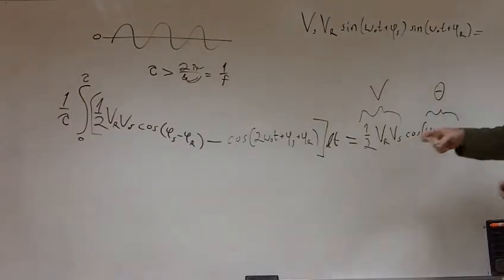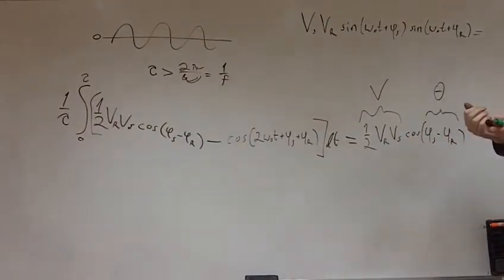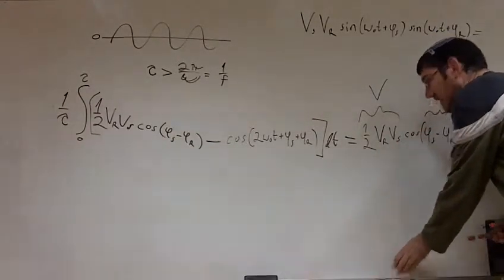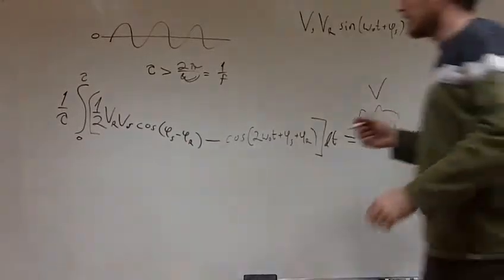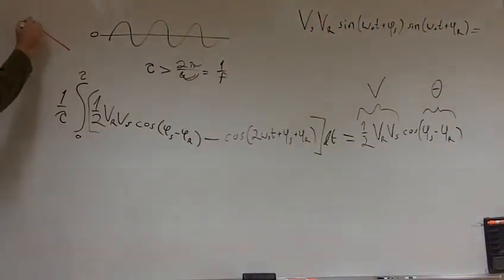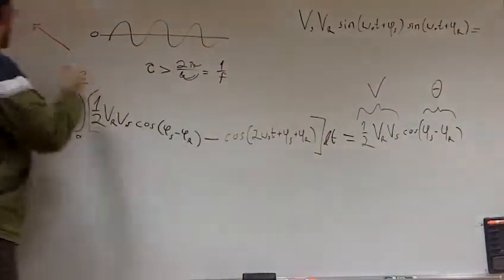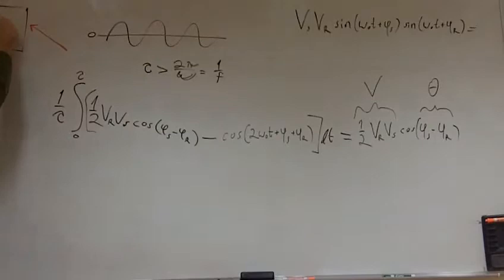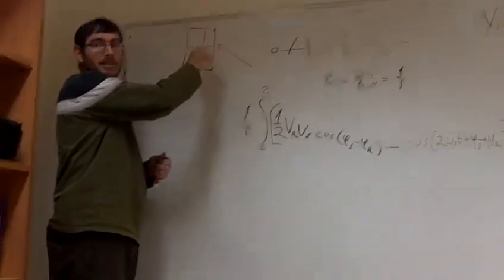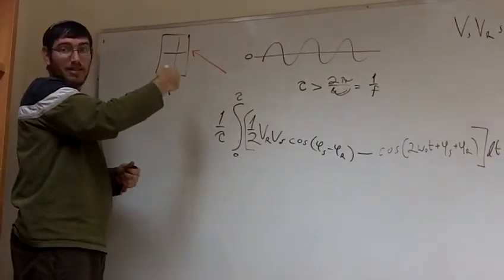Remember we have the PSD, the laser hitting the PSD, oscillating on the detector at a certain amplitude and also at a certain phase.